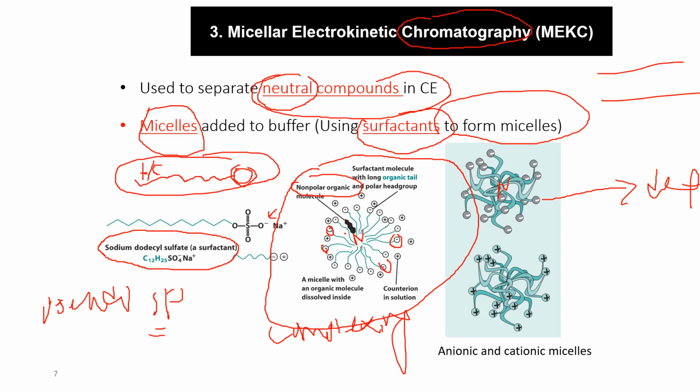Stationary phase. So that's why we call it pseudo. Pseudo is like there and not there, which means sometimes it is there, sometimes it is not. Okay, depending on the application. So that's why it is called chromatography, but this is not to be confused with liquid chromatography.